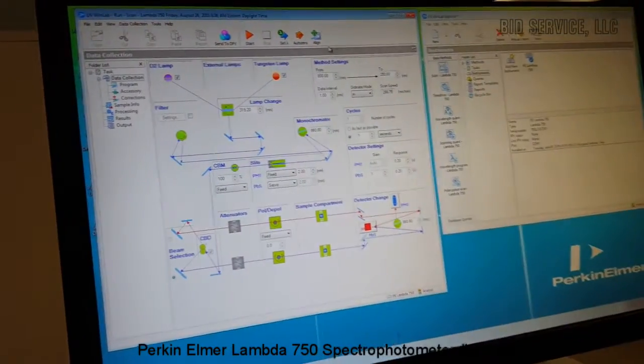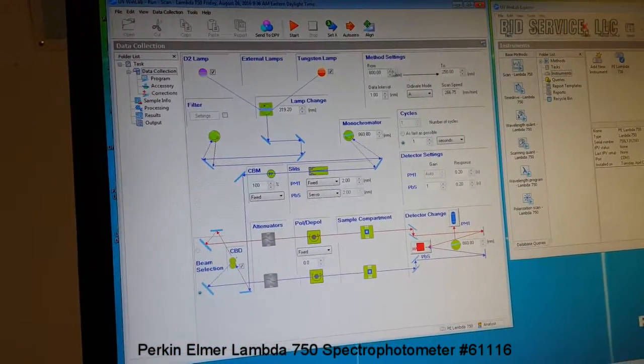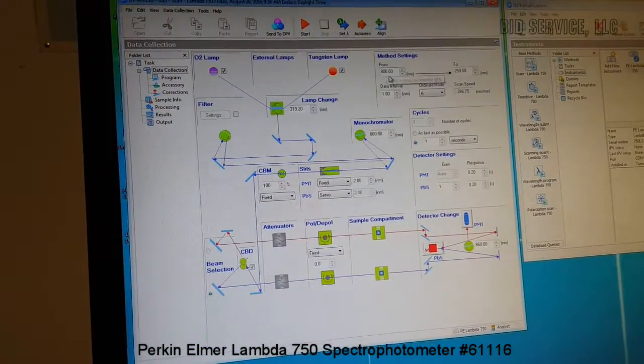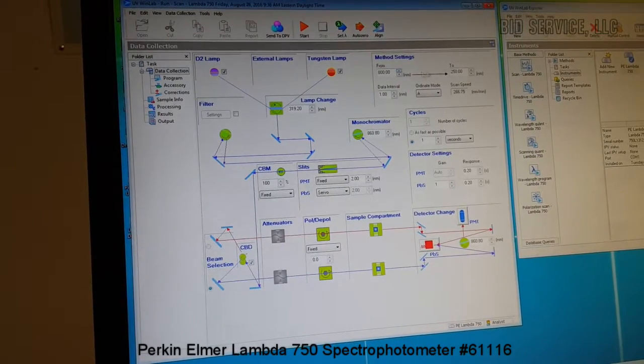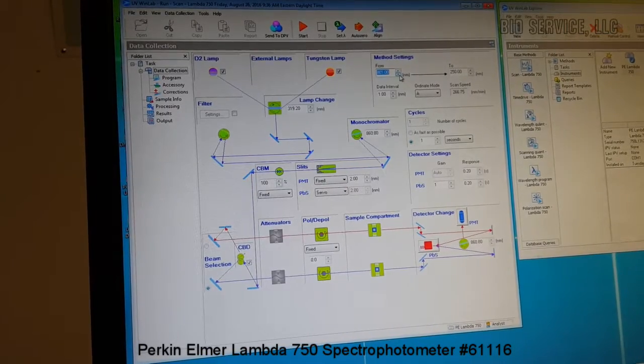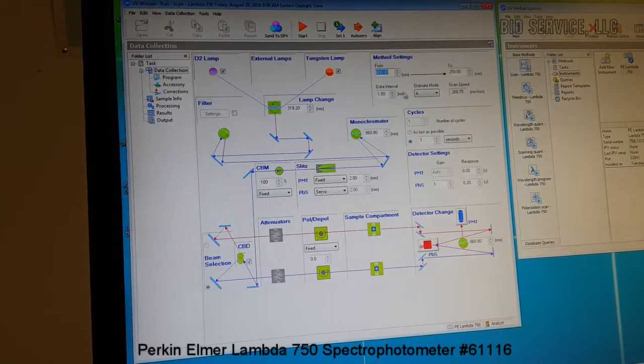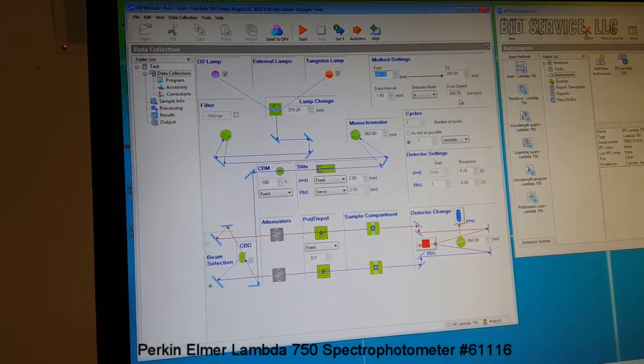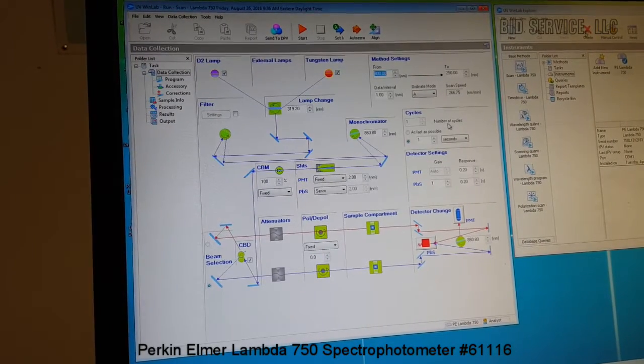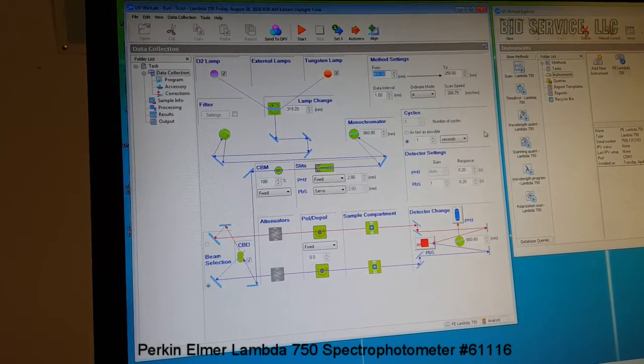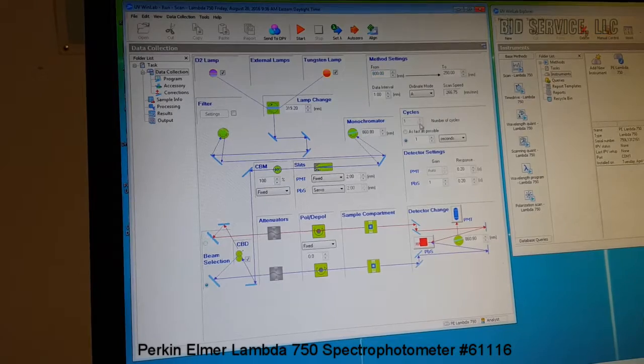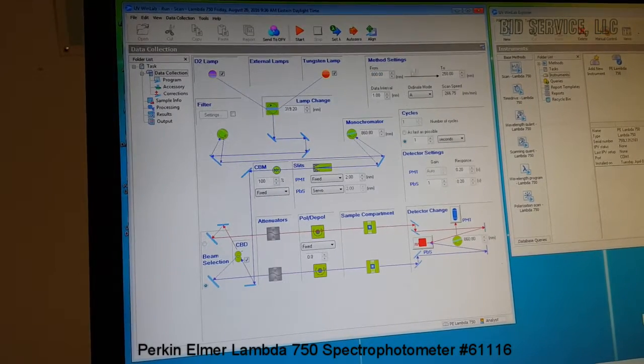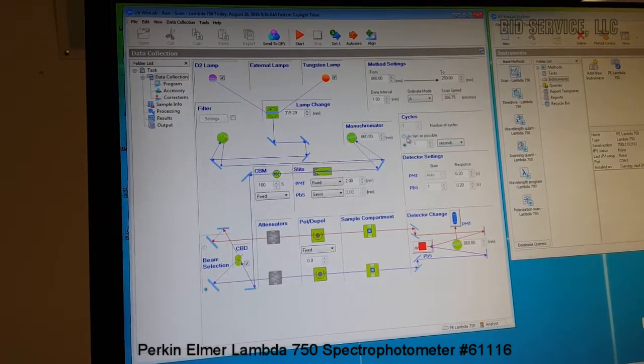Once the method is selected, the from and to wavelengths in nanometers are set. And the data intervals and the scan speed is also set here by changing the numbers. We can repeat the scan's number of cycles. We can increase it or decrease it depending on the desired operation.